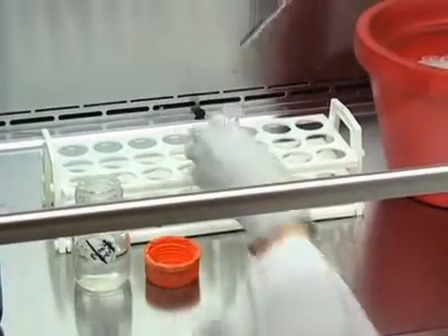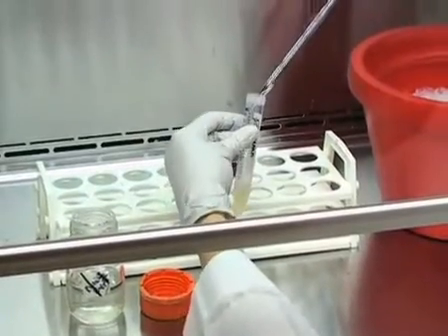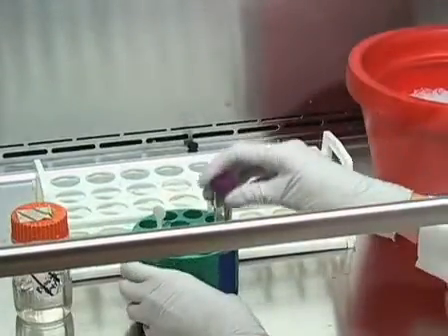Add 10 volumes of running buffer to wash and centrifuge at 230 times G for 10 minutes.